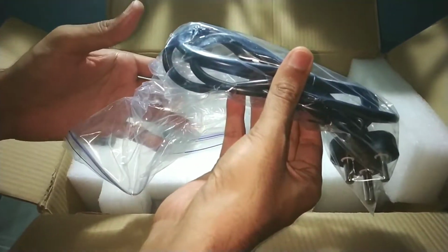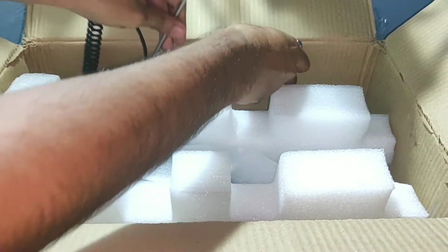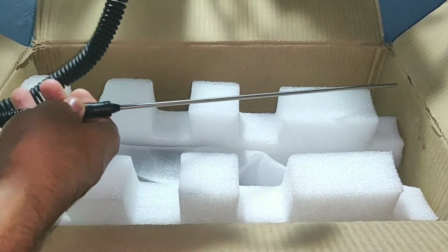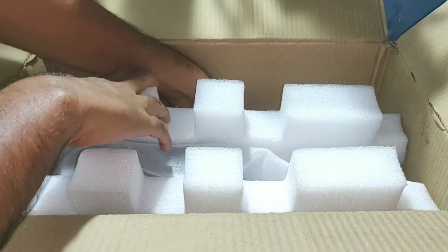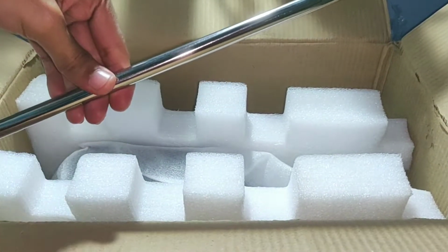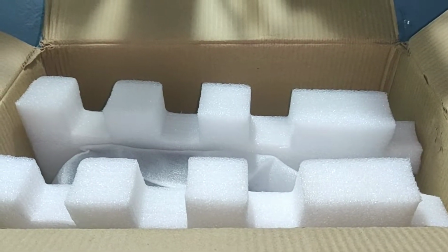The plug is of 16 ampere type, which is not so common in the Indian setting, so make sure you have a 16 ampere outlet in your lab. Another accessory that we have here is the temperature probe, which is a platinum temperature sensor probe with 100 ohm resistance at 0 degrees Celsius, and its accuracy is plus or minus 1 Kelvin, which is very good. The next thing is the stainless steel rod, which is 40 centimeters in length.